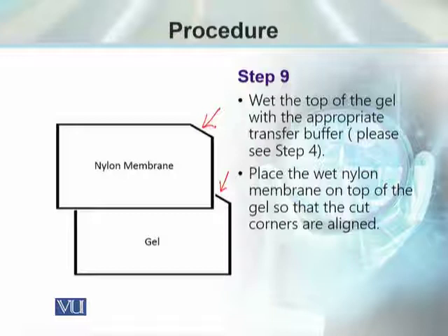अब इस stage के ऊपर again we have to take care of the air bubbles. If there are any air bubble in between the membrane or in between the gel, they are removed. अब यहाँ पे sometimes जो student है वो गलती करता है कि membrane जो है वो properly settle नहीं हुई gel के ऊपर. So once it is placed over the gel, it is not recommended to remove the membrane. Let it be like it and then proceed further.